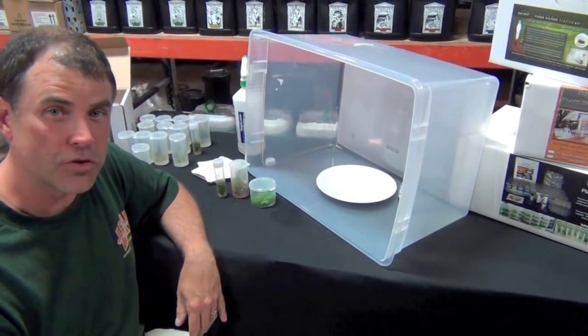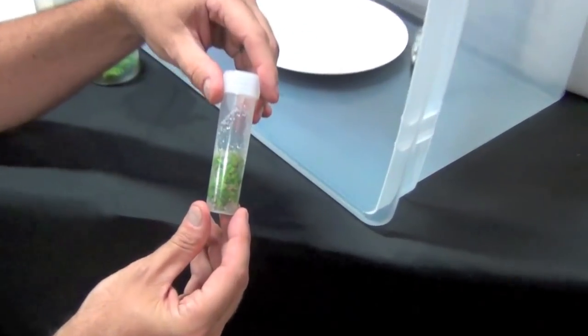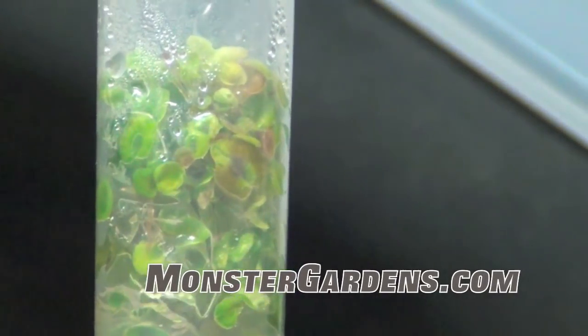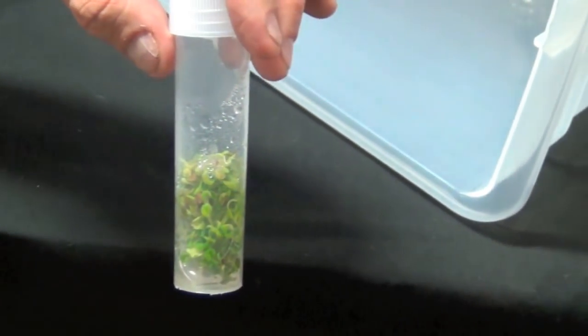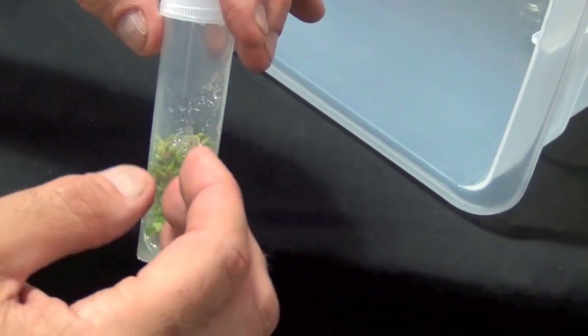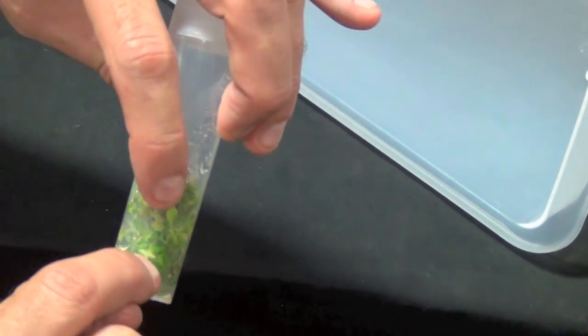I wanted to show you a couple of plants in tissue culture that I brought with me. This is African violet — you can see all those little bitty leaves. What this is, is actually about 30 African violet plants all growing one on top of another — each one is a little distinct plant. I'd take this out, put it on the plate, and divide it into as many pieces as I want. I really only want about this much of this material to go into a brand new mother container, and the rest of these plants all get planted for rooting.